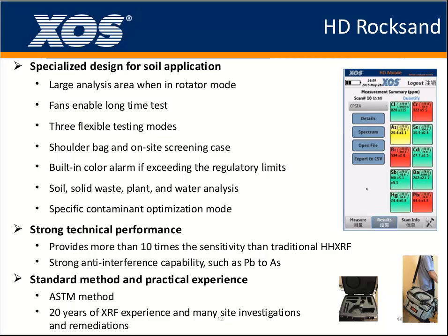It's relatively easy. And if we want to do a quantitative analysis, we need to take the shooter bag and take the test stand and the gun together onto the site.